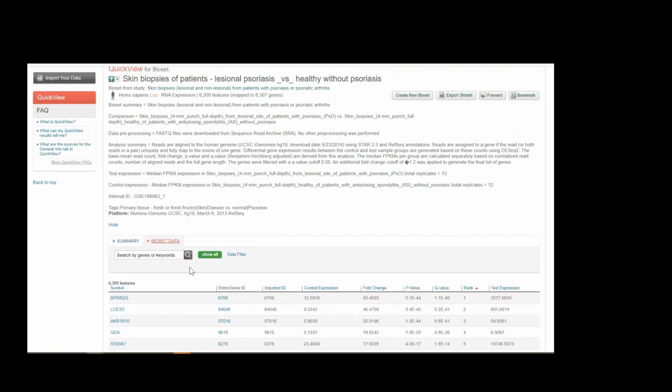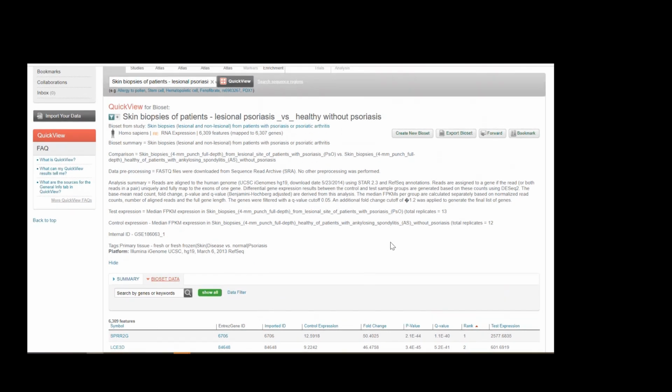It's a good time to point out that you can export data throughout the system. A complete set of application programming interfaces enable data scientists to query, retrieve, and integrate correlation engine results into their engineered work streams.